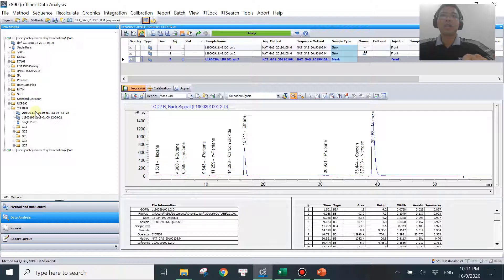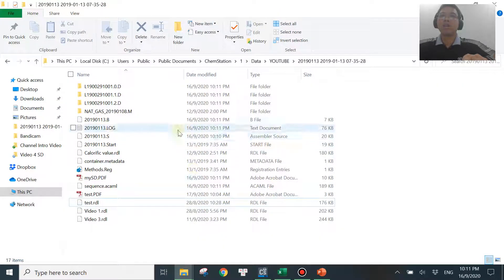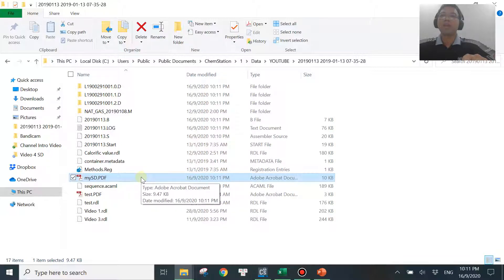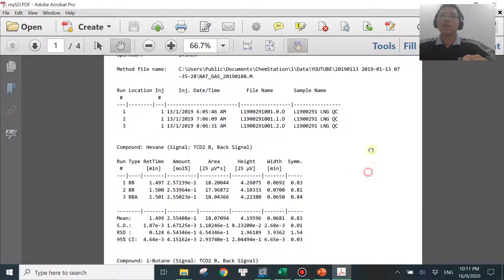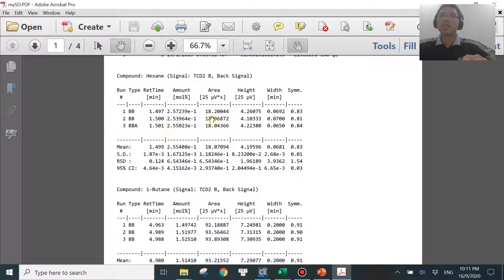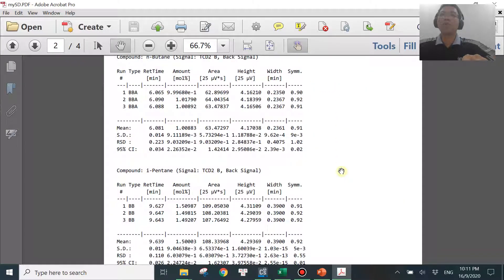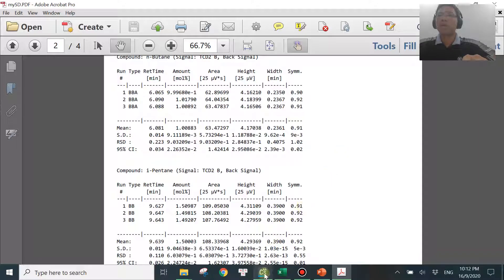Go to the folder that contains your data. The PDF file named 'my SD' that was just created will be available there. Open it and this is your standard deviation report. We had three runs. Every single compound will have retention time, amount, errors — I think these two are the most important — plus the mean value (the average), standard deviation, and RSD (relative standard deviation). You can use this value for your limit of detection calculation or check the RT to see how much your values are fluctuating.